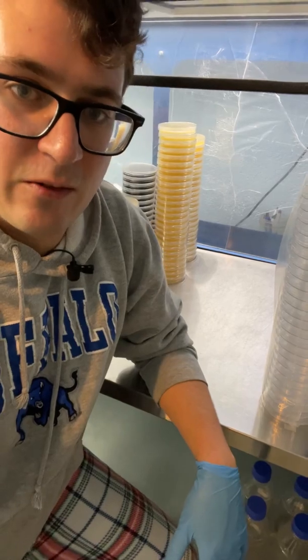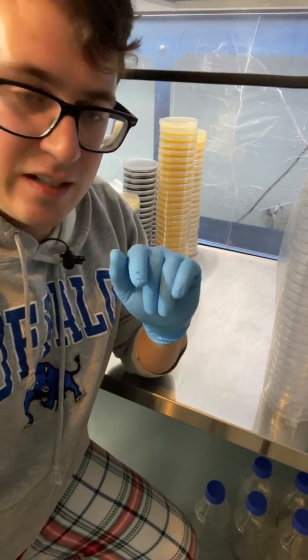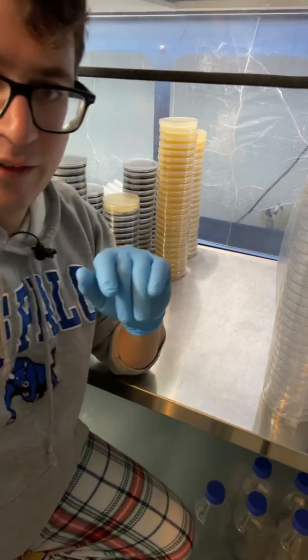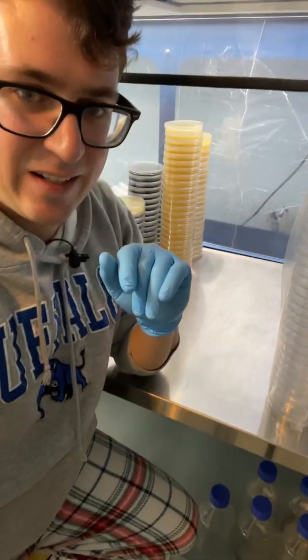Shout out to everyone for joining in if you're pouring agar. I just did about three and a half liters in 12 minutes — so that's a good bar to set.